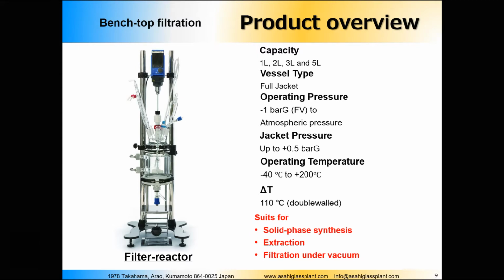So again, it is important to explain this to the customer and to be sure that they are not purchasing the filter reactor for this kind of process. But as I already told you, you can do solid phase synthesis inside this reactor. I'm not quite sure if you are familiar with this kind of thing, but I would like to explain the solid phase synthesis.